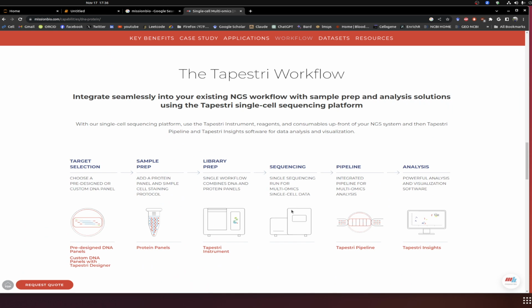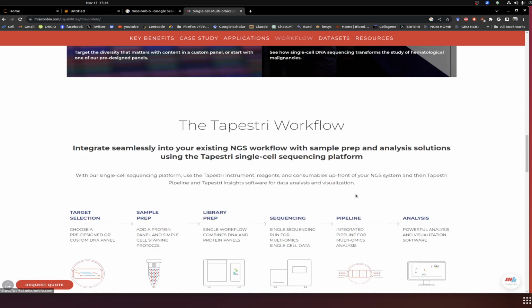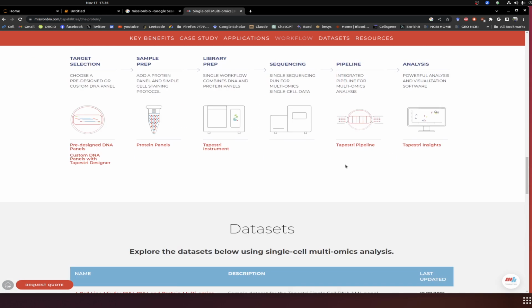The platform name is the Tapestri platform. You can come to this website and find details about it.